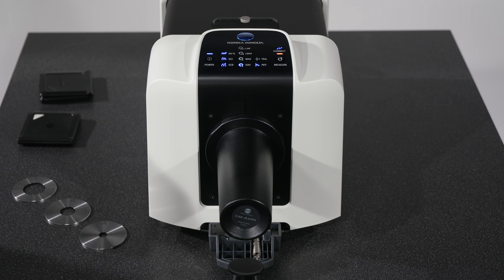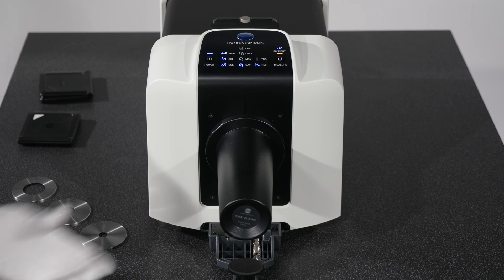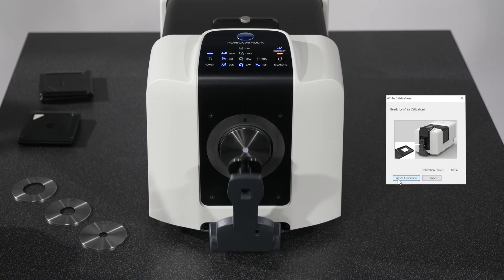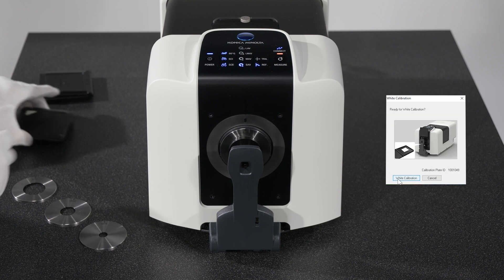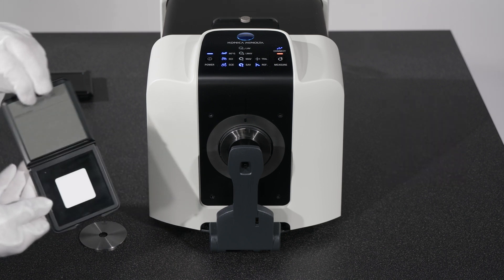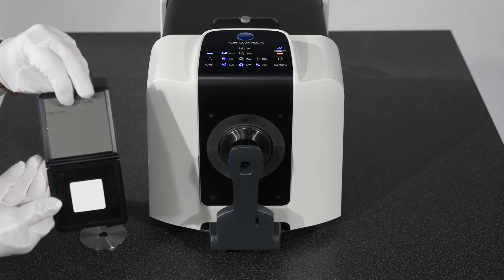When Zero Calibration is finished, follow the prompt to attach the White Calibration plate. When positioned, click to start the calibration.